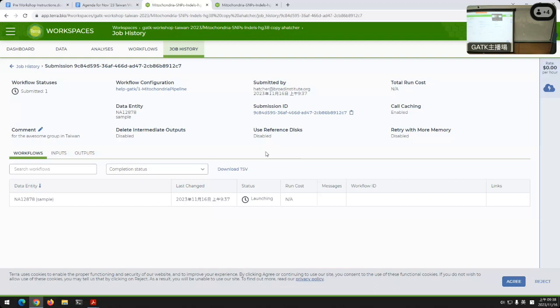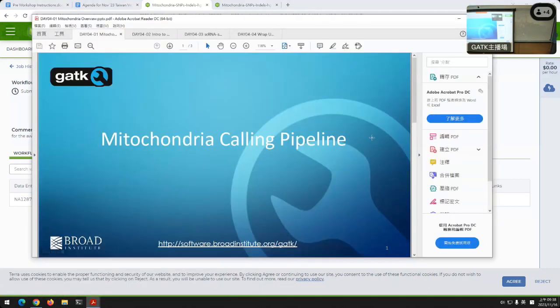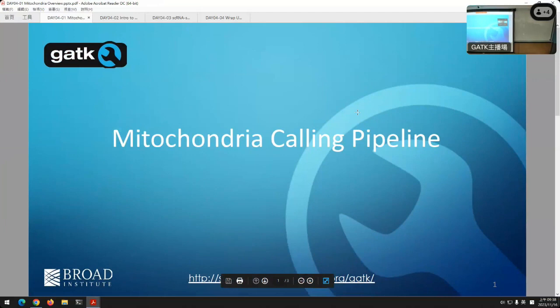So I guess the question is, I told you I'd tell you why we have this workspace in the first place. Let me hop over here and talk about that a little more now. What is different about mitochondrial DNA, and why do we have a whole separate pipeline for it in a featured workspace?